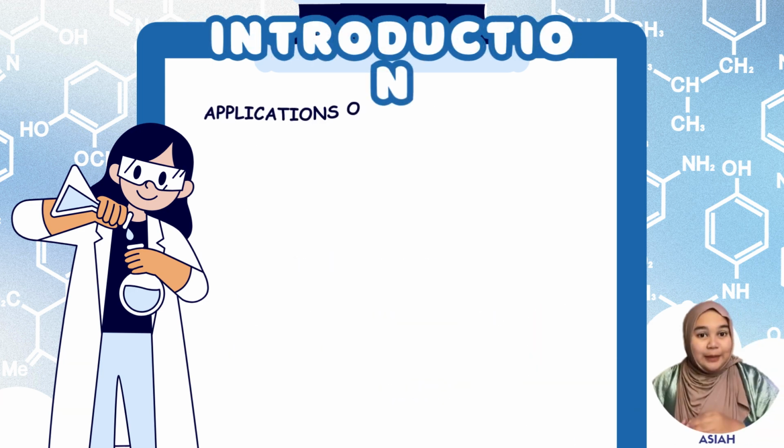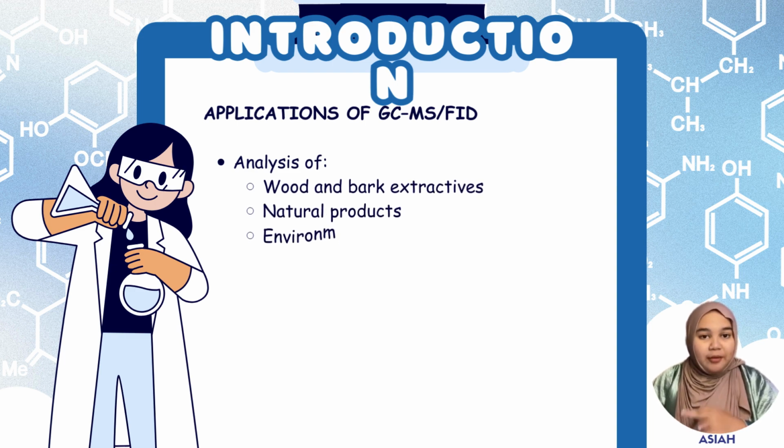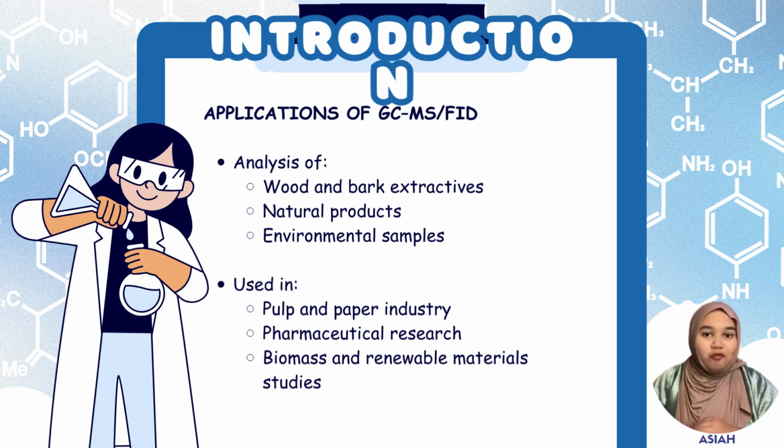This analytical approach is widely applied in wood chemistry research, environmental analysis, and natural product studies. It is also useful for evaluating the potential industrial value of bulk extractives.